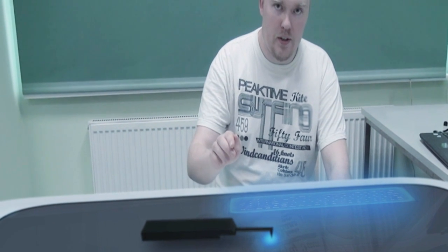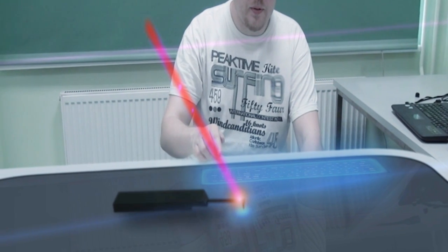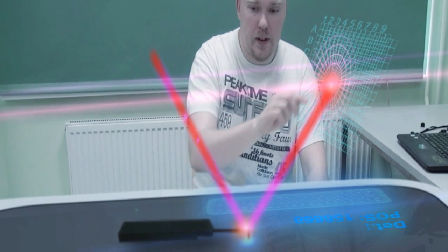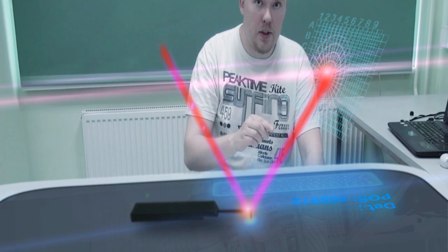The cantilever deflection is monitored by the laser beam, which is focused on the cantilever, and the light is reflected into a detector. If the cantilever bends, then the position of the laser beam changes.